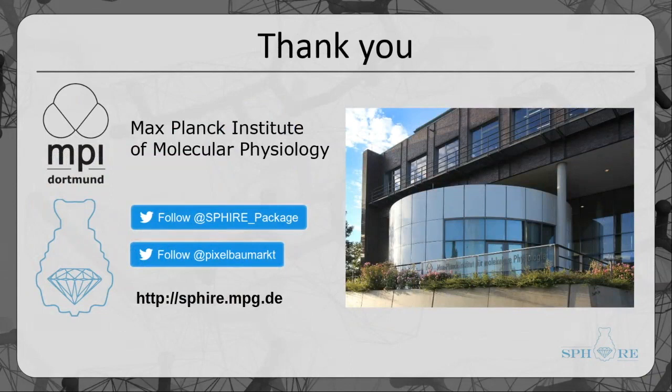So I've got one question here. How is the downsampling handled from non-square micrographs, K2, K3? Yeah, it's still converted to 1K times 1K. But this doesn't matter because during prediction it will do the same. So even if the particles will be then in principle squeezed a little bit during training, as long as it sees the particles in the same way during prediction, and it does if you don't change the settings, this is not a problem.